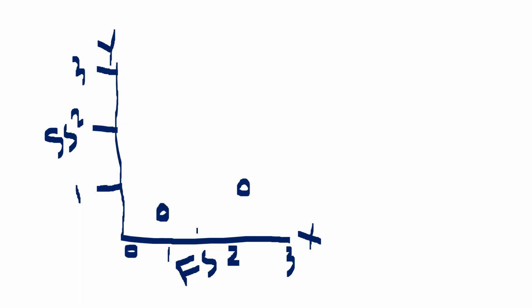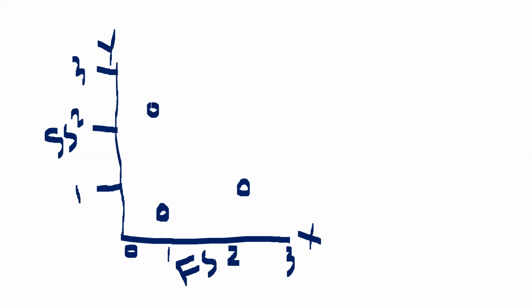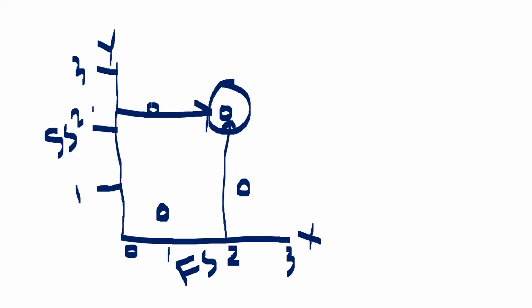And if the cell is more complicated, if it is a granular cell, we will get around here. So this is a small cell with more granulation. If we are getting around here, it indicates it is a large cell. Since it is here, it is a large cell and it is also complicated. So we are getting two data. So this will be a large cell with granules, meaning this will be eosinophil.